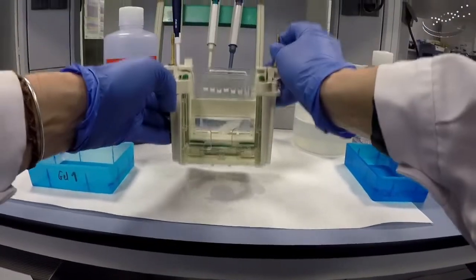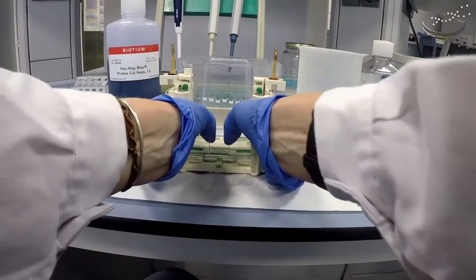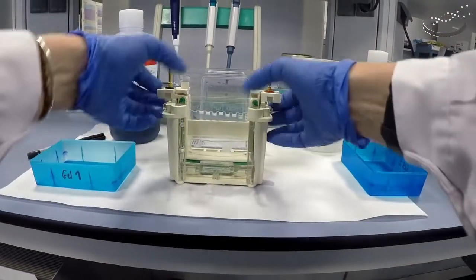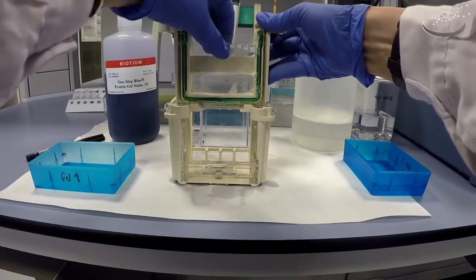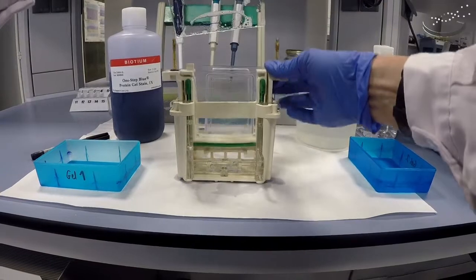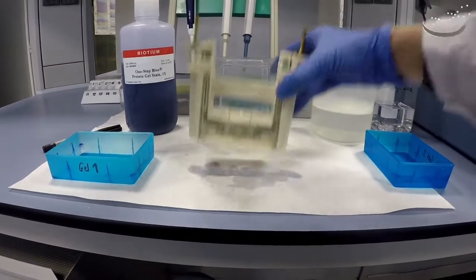Once that is done, we will remove the inner part of the gel system. We'll open up the doors of the support, which will release the inner part where the gel is. We'll lift this up, take the gel out, and then store the electrophoresis system to wash it later.